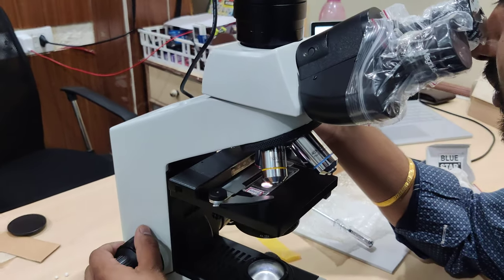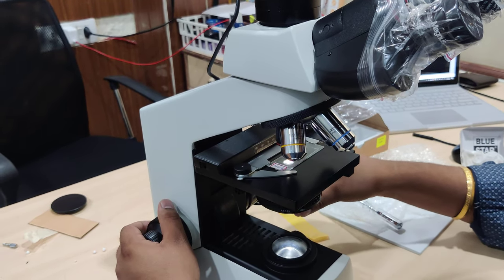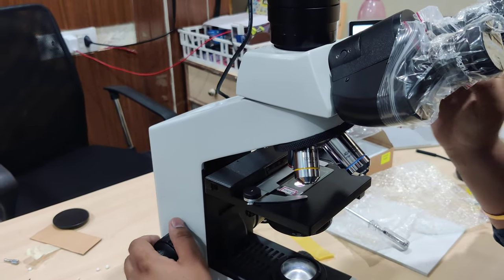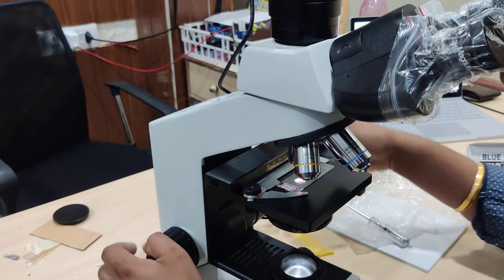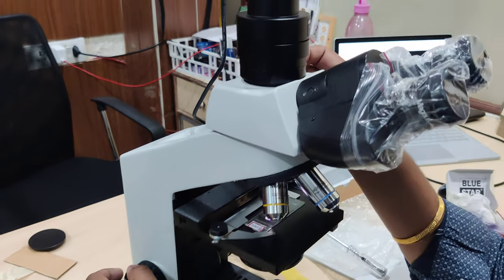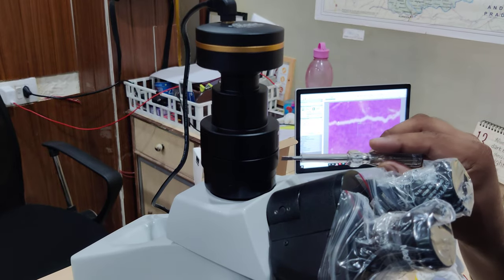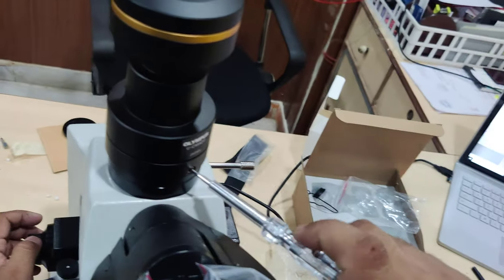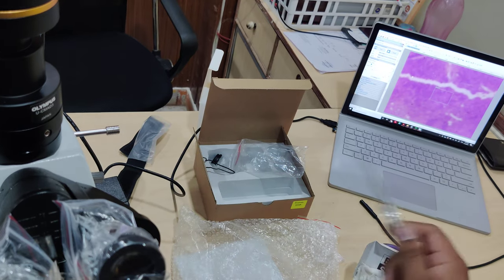Once you are able to see the focus on the slide part and you want to make it focus over there, you use the focus ratio over here. With the help of this LM key, you can rotate this part and get the focus area.